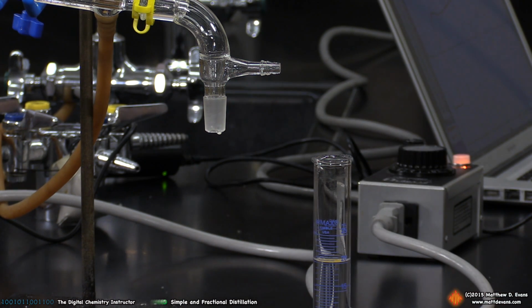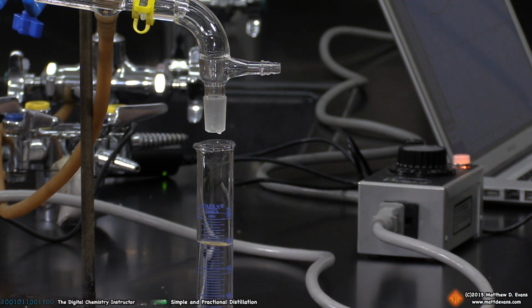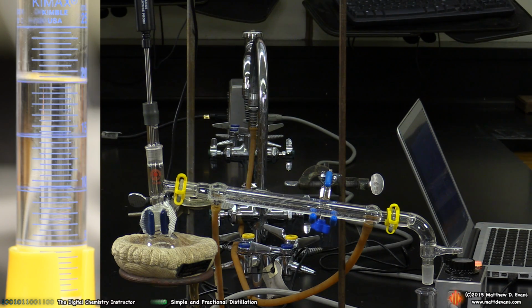I'm done with this cap. I'm going to go ahead and collect a little bit more distillate just to make sure that I've leveled out in terms of the second temperature I'm looking for. So remember, the whole idea of this experiment is to identify the two components of the mixture. Yours is truly an unknown, so I want to make sure that I get two separate stable temperatures so I can later identify what the compounds are.